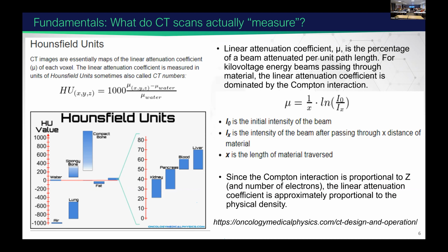This is a kind of medical field scale. You can see that the bones and the different organs have different CT numbers associated with them, and we also use them, for example, in our way to estimate wet bulk density from MONet cores. In our formula, we also use the Hounsfield units.